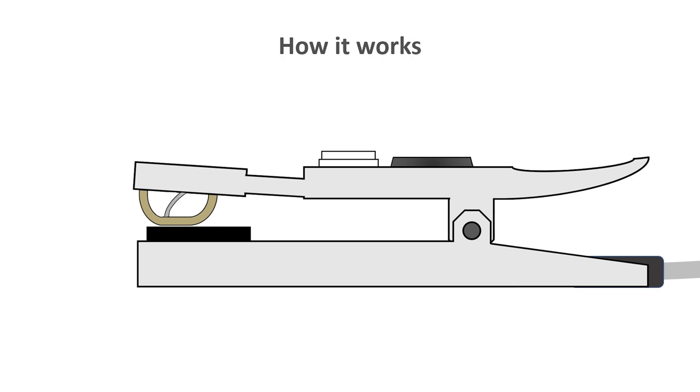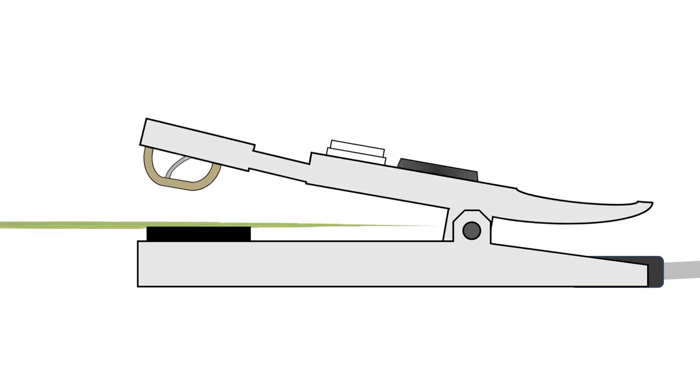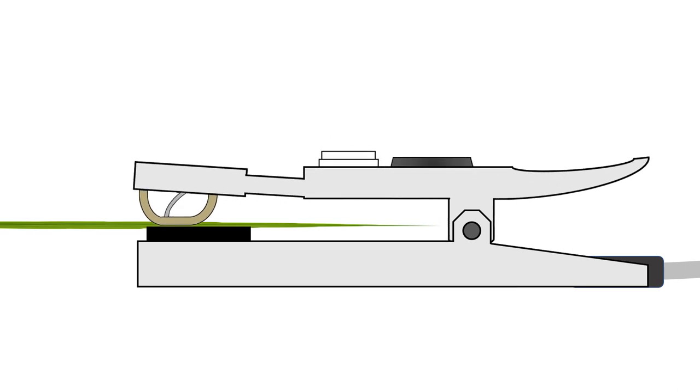Let's take a closer look at the AP4's sensor head. It consists of a gentle spring clip that can be positioned easily onto the leaf, a thermistor for measuring leaf temperature, a small chamber, the cup, that lies directly below the leaf surface.